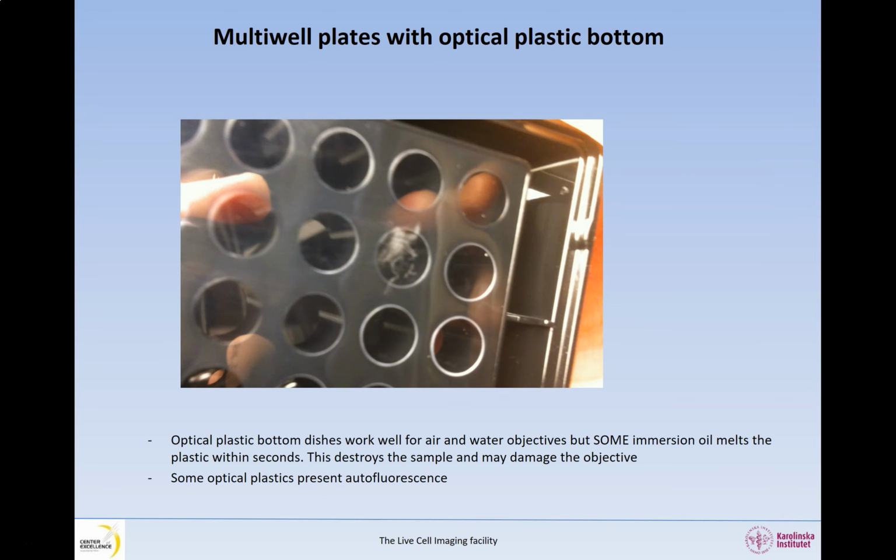Optical plastic dishes and multi-well plates work well for air and water objectives, but some immersion oil melts the plastic within seconds. This destroys the sample and may damage the objective. On top of that, some plastic bottom dishes can be slightly fluorescent and would influence your imaging, especially in the blue and green channels.